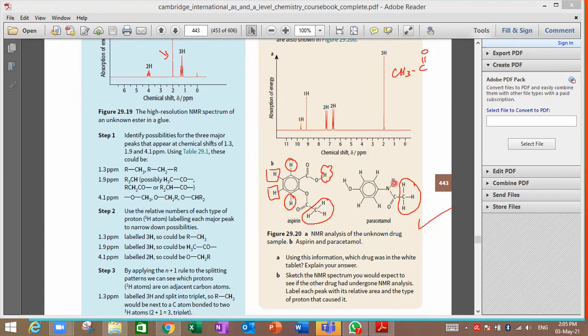But here we have an NH. This means that this is a singlet. OH, it's another singlet. And these two hydrogens are equivalent. They are bonded from both sides like the same. And these two hydrogens are equivalent. They are bonded from both sides the same. So we have here two peaks, one of them corresponding to two hydrogens and the other corresponding to the other two hydrogens.